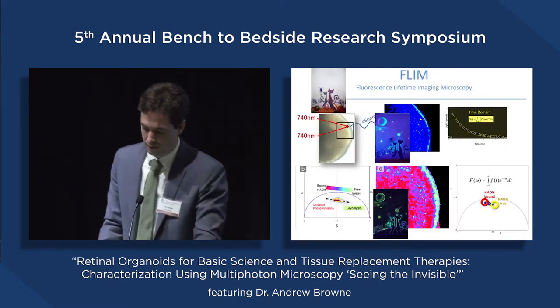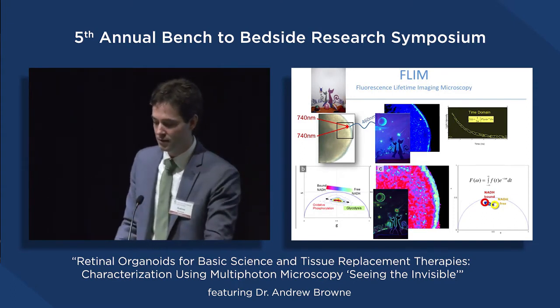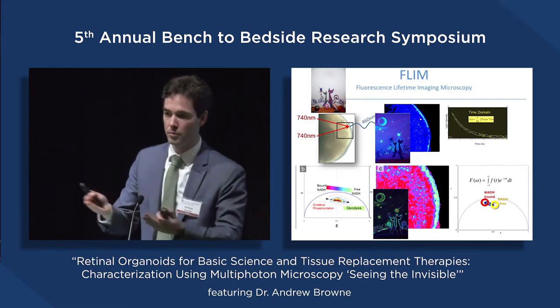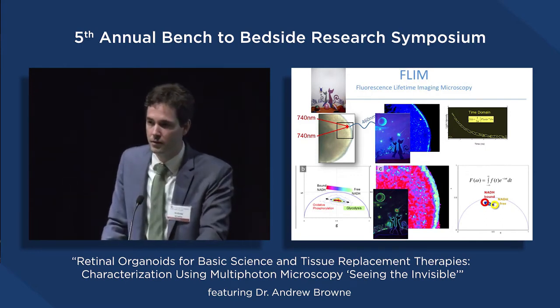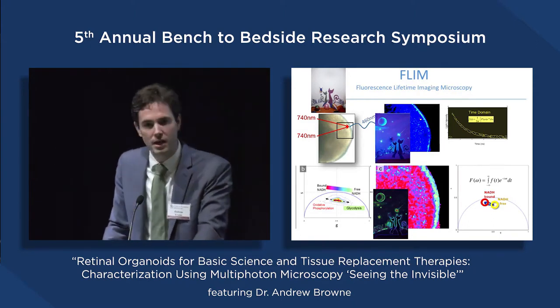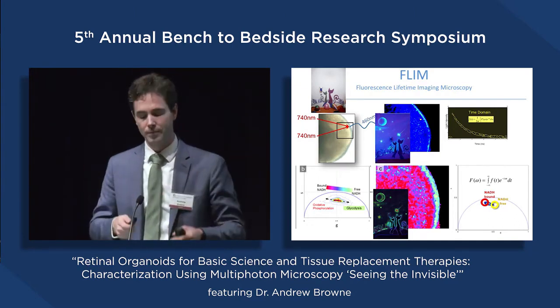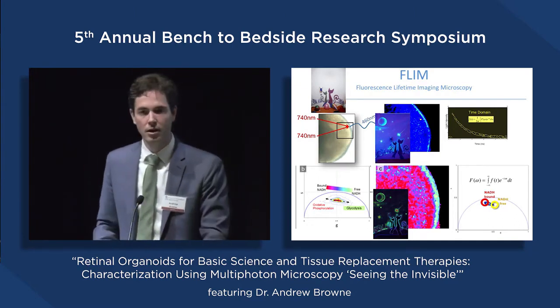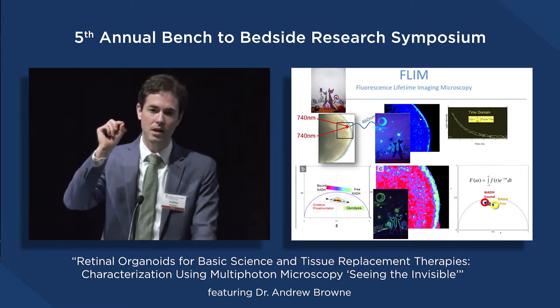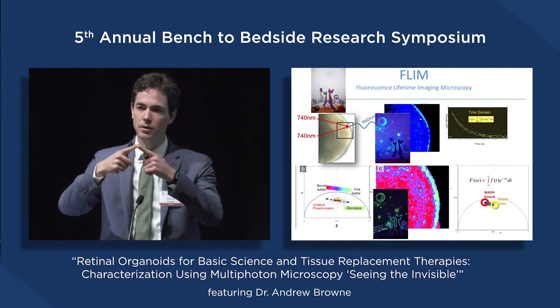So now is the elegant introduction. I hope it's elegant. I hope I can do you service as to the work that was pioneered here by Enrico Gratton and is performed by the strength of biophotonics in Southern California with Enrico and Scott, who are our next two speakers. Fluorescence lifetime imaging microscopy is this special technique where we can take two lasers and shine a light onto a very specific point in space. When I'm saying shining a light, I'm saying we have a nanoscopic coincidence of these two lasers, subcellular localization.